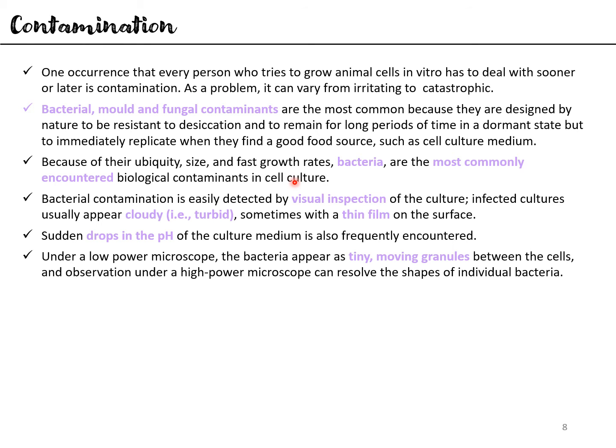And if you focus it at high power, let's say at 75x or 100x, you can easily make out the shape of the bacteria. And not only that, and I would say this from personal experience, you can even see the bacterial cells as they're moving and wiggling their way through the medium, and how they're attaching to your cells. You can see everything. Well, you can't really see them attaching, but you can definitely see them wiggle through the media and go and hit your cell.